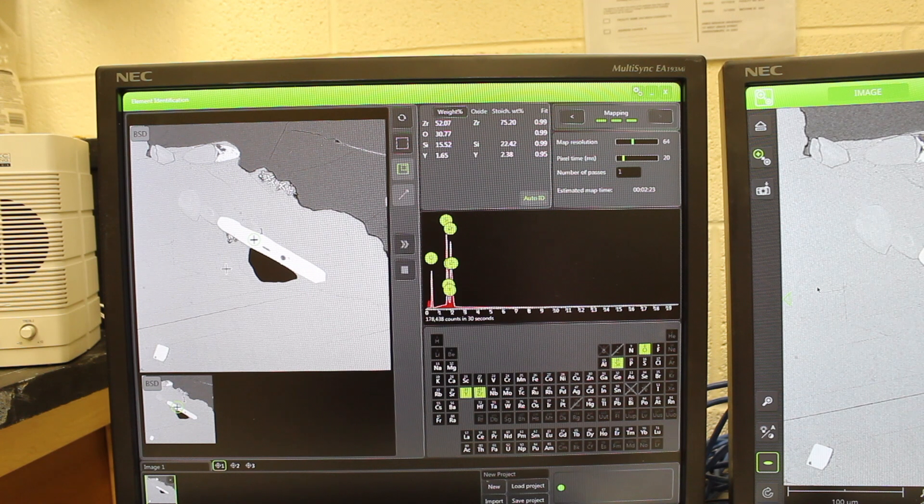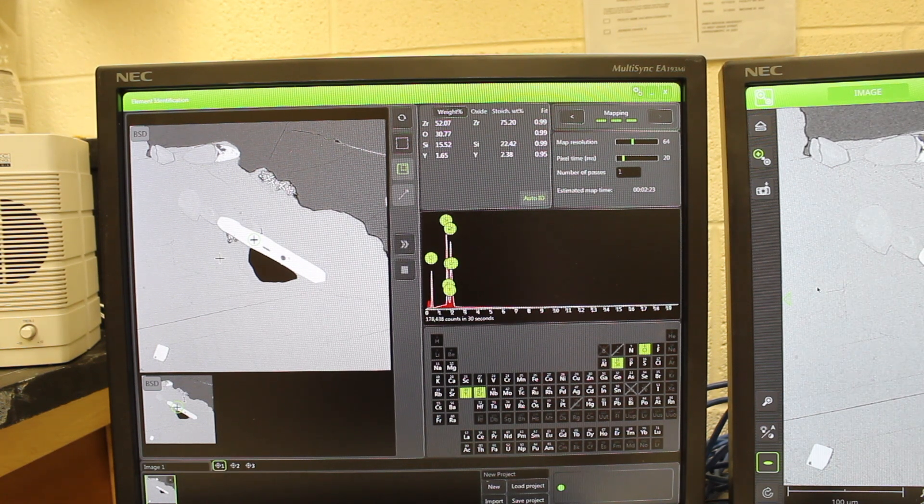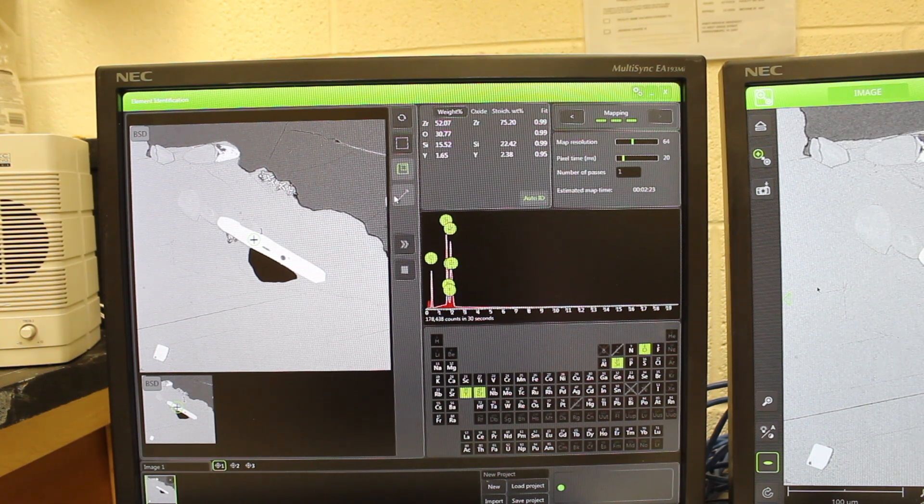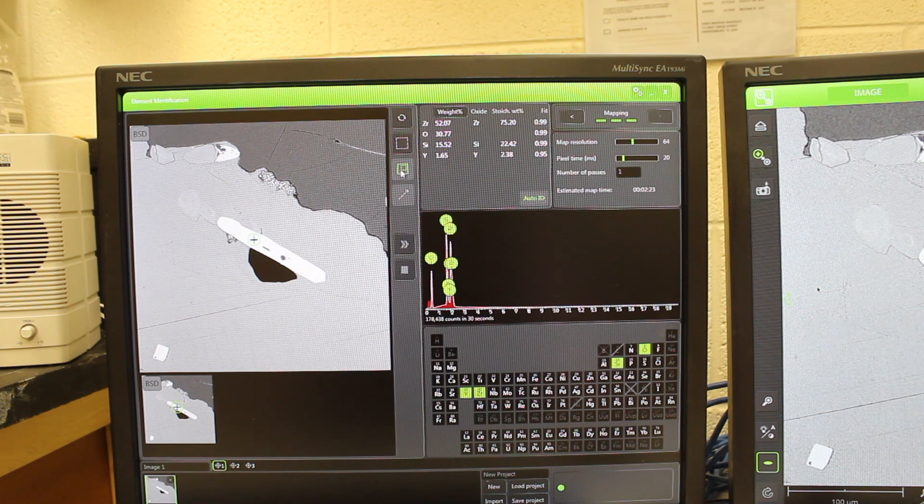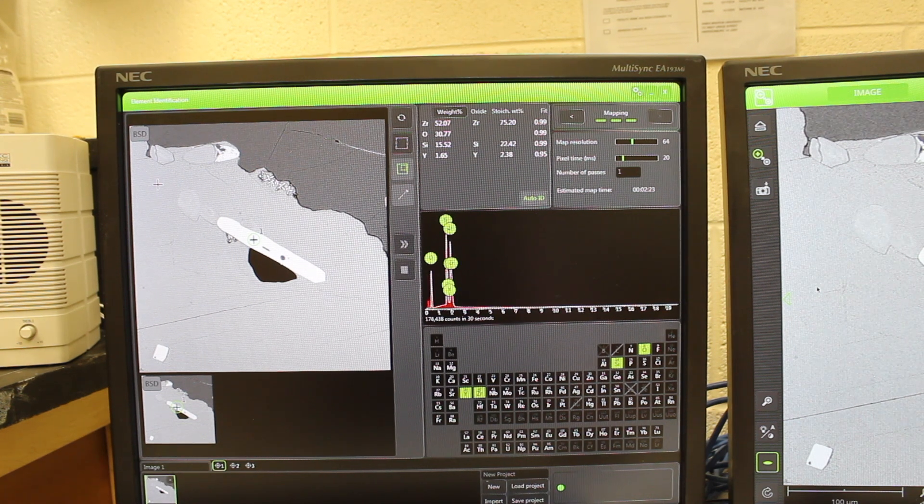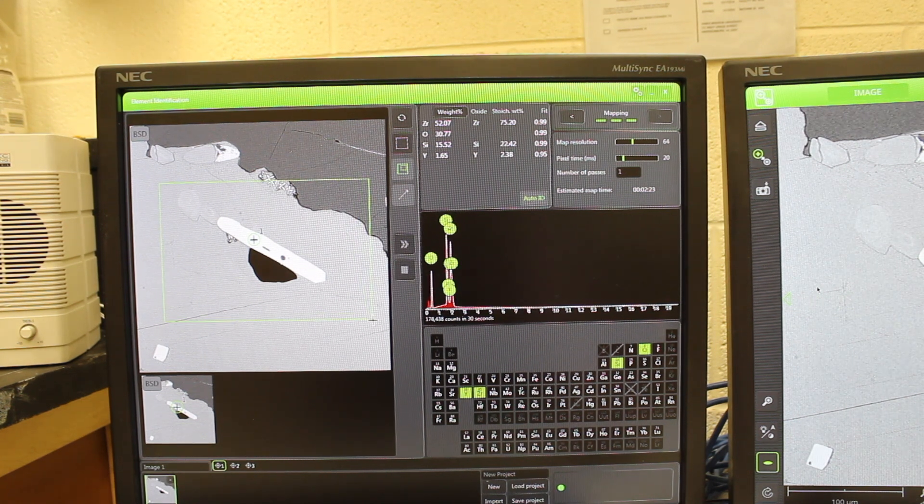This is useful if you want to see zoning across one or more minerals. For example, if I want to make a partial map here, and I'm going to map this area only.